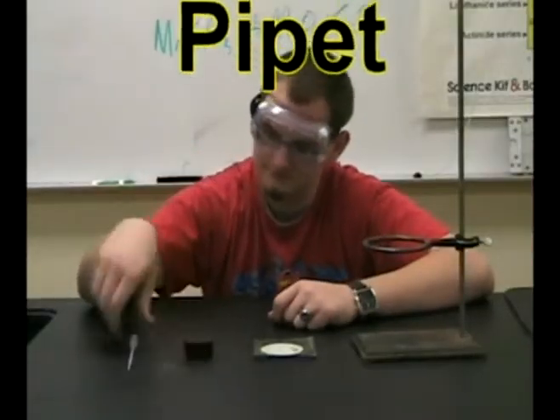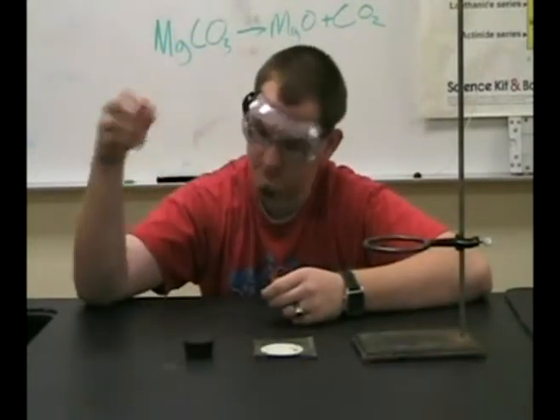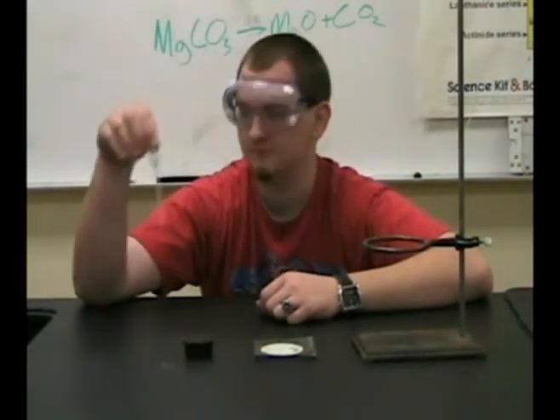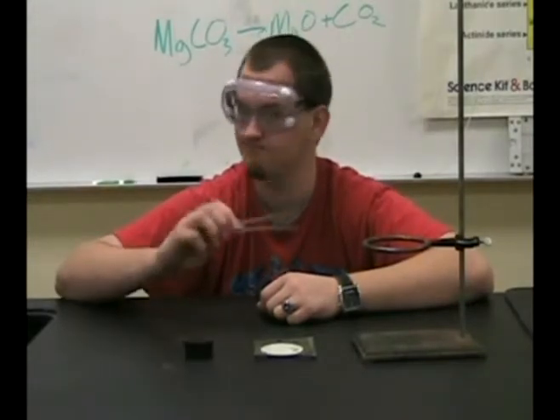Pipette. Pipettes are used to measure, add, or remove tiny amounts of liquid from larger things such as beakers, graduated cylinders, and flasks. You shouldn't try to move large amounts of liquid because it is so small.